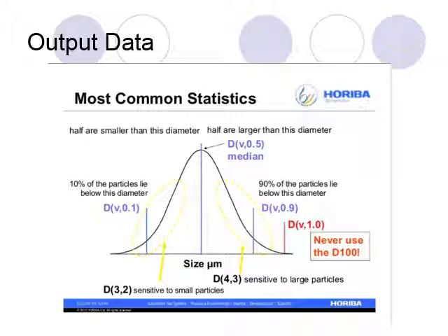Don't give statistics that you don't have good confidence in. And for particle size, because there's so much that can happen with the bubbles, with a hard single particle, a certain agglomerate that you can't break apart, something that had been a little sintered, anything, especially on the large end, that will show up in your D100. And is it real? It may be, but you also cannot give the faith. So there are very few customers, there's one in particular, where we use the D99, but they have a very special disclaimer on it.